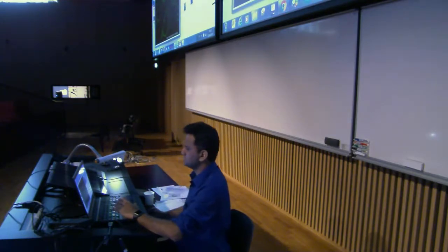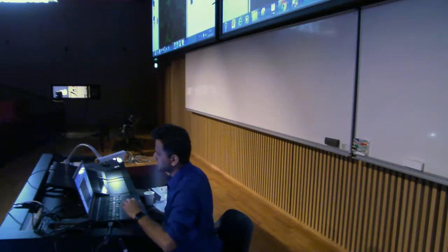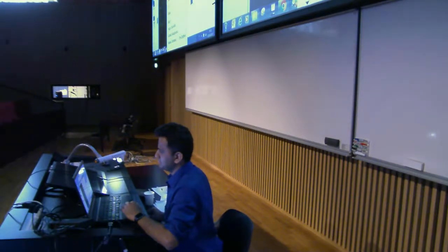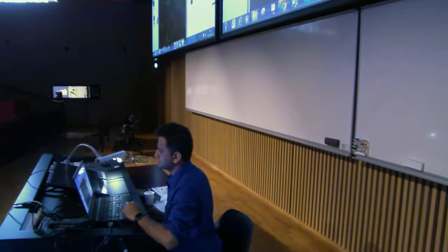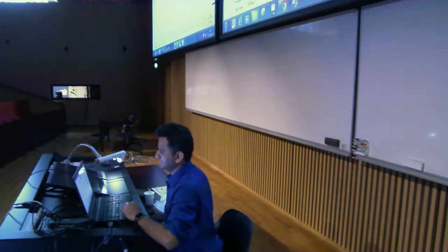There are different types of algorithms for finding edges, like the Canny edge detection, the Sobel and the Prewitt and other things. But I will cover how to use it and when to use it in the advanced level training. So process, sharpen, find edges, find maxima. That's also possible. So let's open some image. Open here and just go to C-type, Fiji.